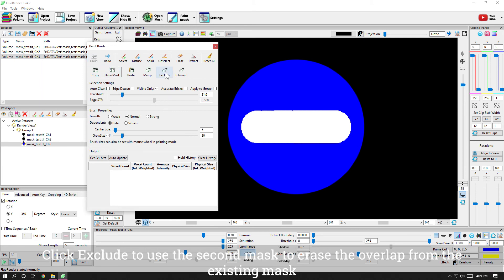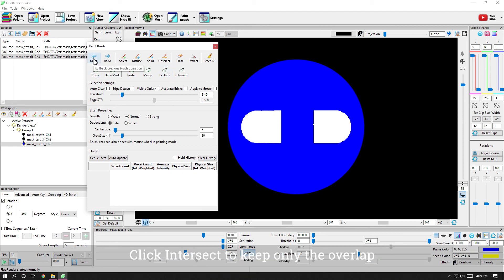Click exclude to use the second mask to erase the overlap from the existing mask. Click intersect to keep only the overlap.